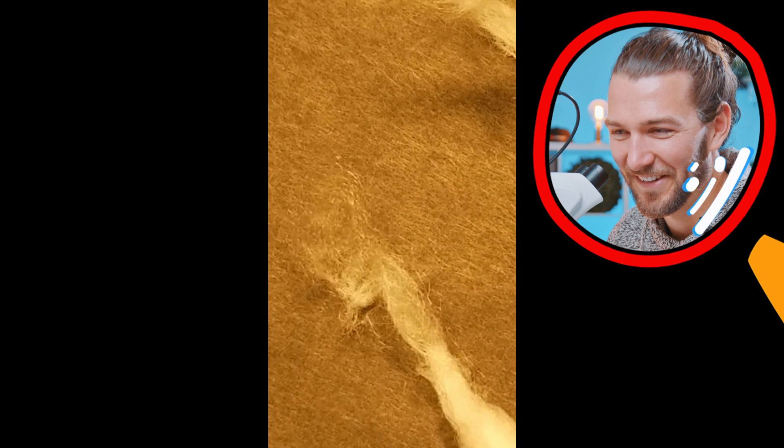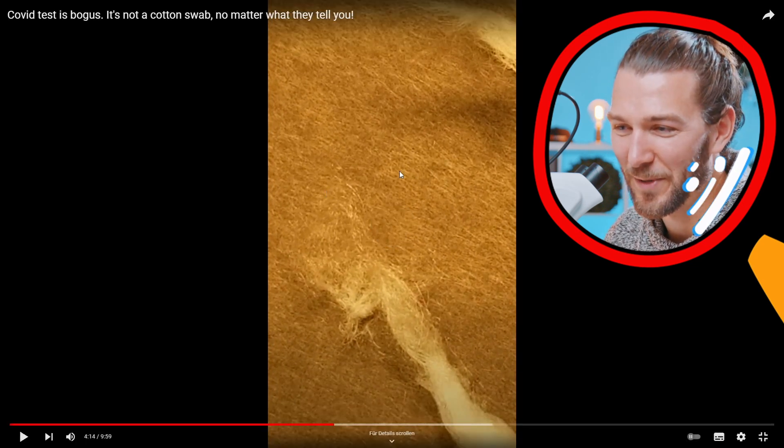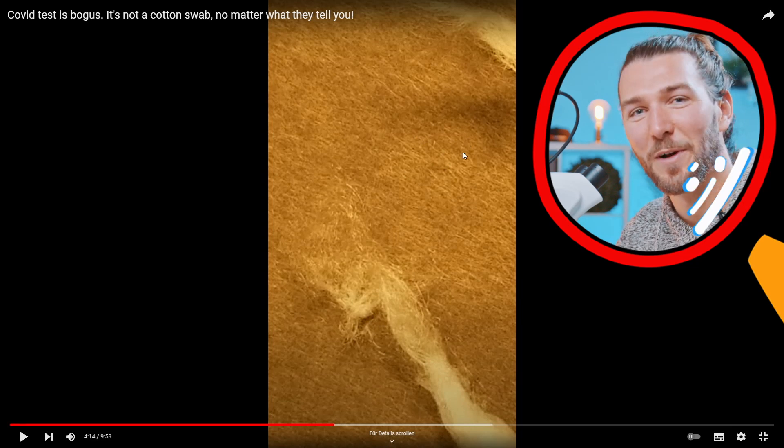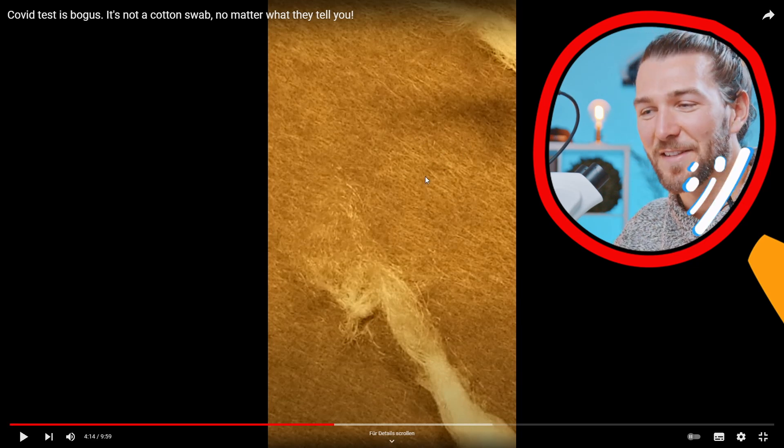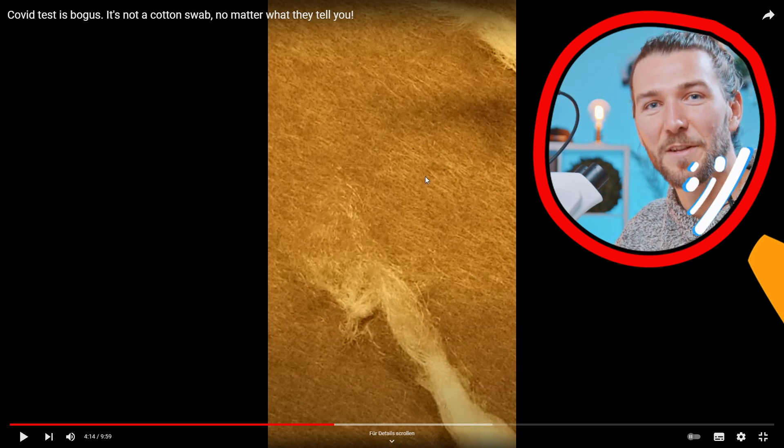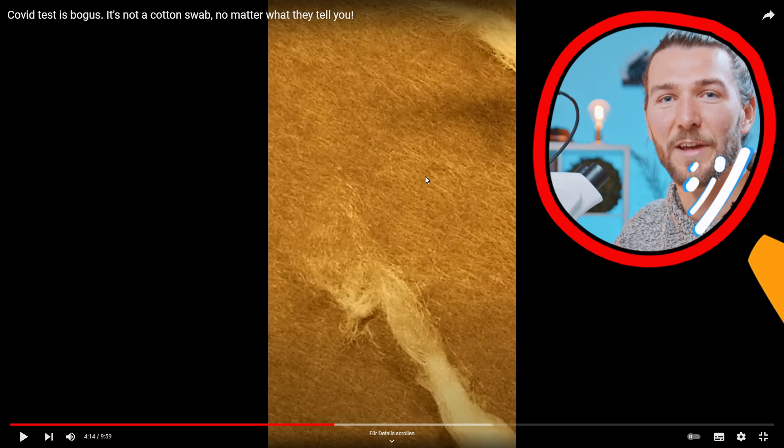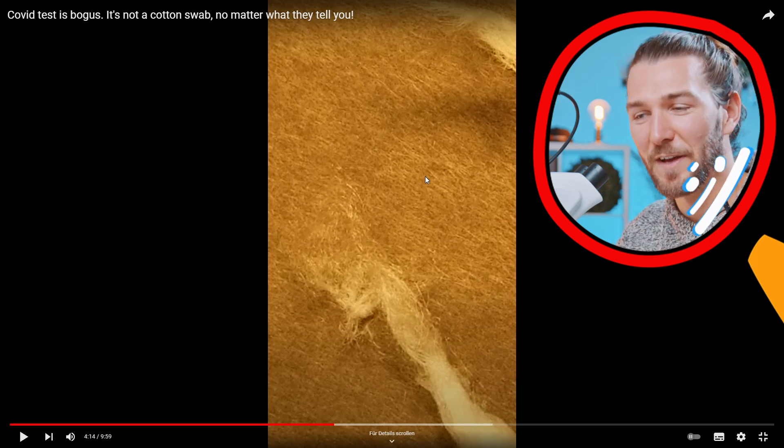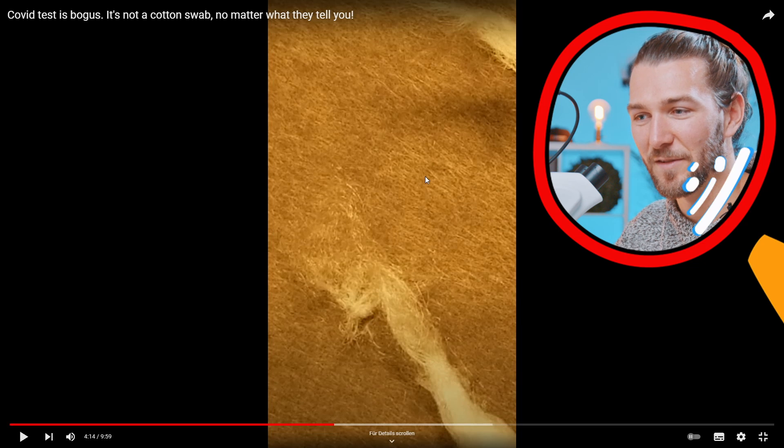Yeah there was a small fiber up here a second ago and you saw how it's moving around. And these fibers are so small, just a little breeze through the air or the ventilation has a huge effect on the small light particles like this. They start to vibrate and move around.